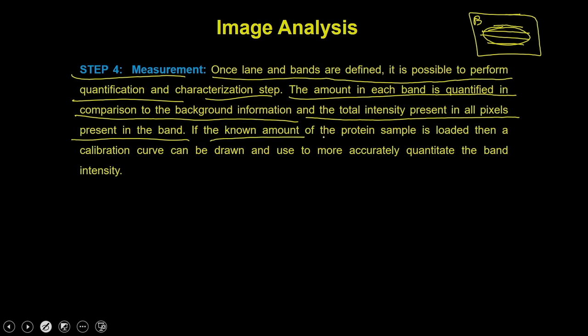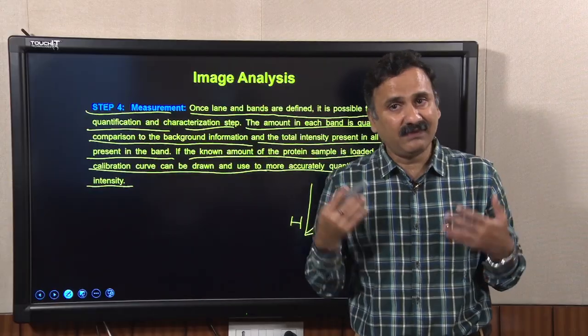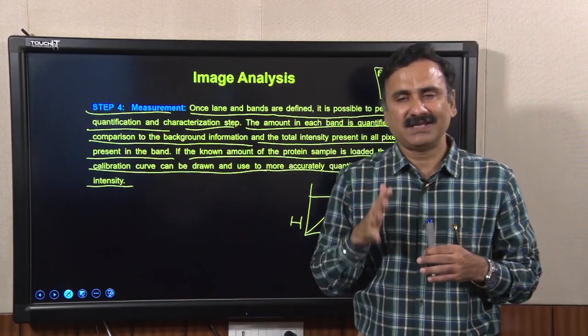So if a known amount of a protein sample is loaded, then a calibration curve can be drawn and used to more accurately quantitate the protein band. Which means, if you have the known amount of the protein, you can measure the intensity versus the protein concentration and draw a calibration curve between these. And once you have that calibration curve, you can use it to measure the intensity of the protein present in this particular band. So this is a brief overview of the image analysis.